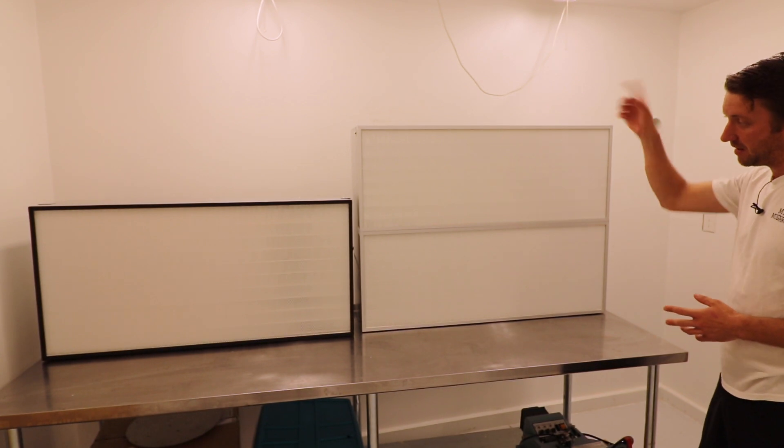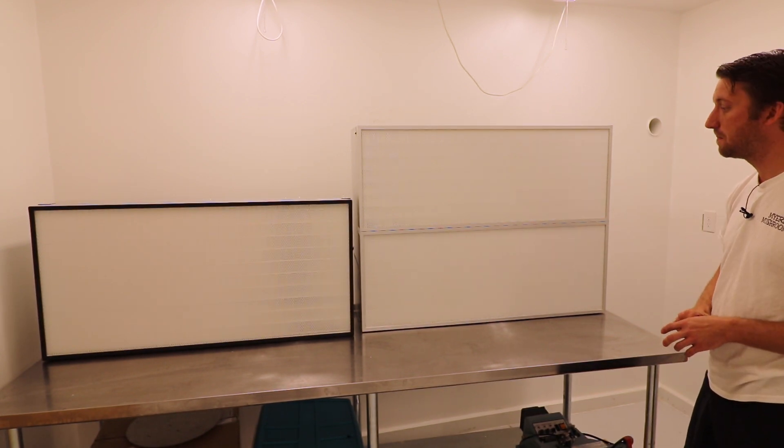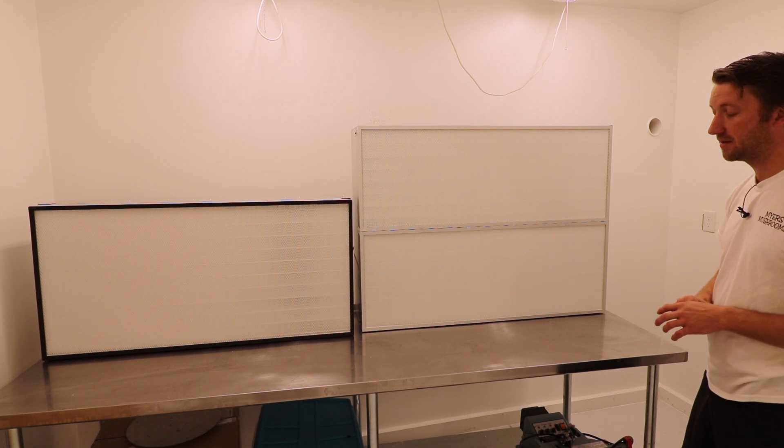I'll be running two of these in my spawn lab. I'll probably stick with the 2x4s in here — this is the sawdust lab.